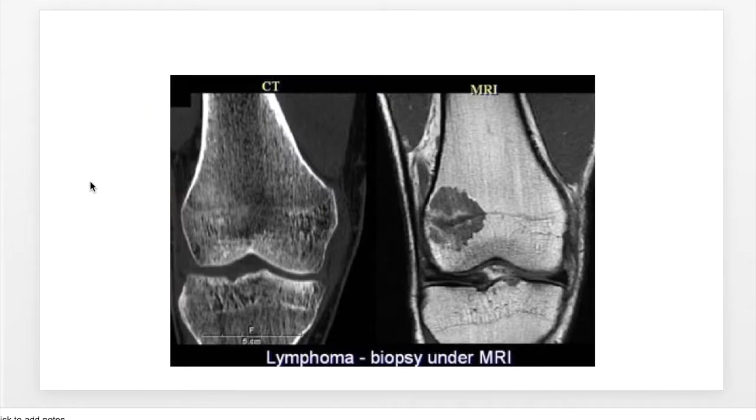The LCPC transform is also applicable to really any image or other biological system, such as here CT scans and MRI scans. The only thing that the investigator has to figure out is where to place the point of origin and what features they want to quantify. Is it just the edge? Is it the degree of pores, and so on and so forth?